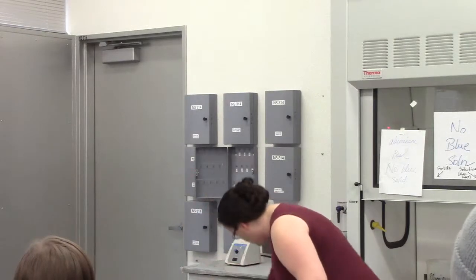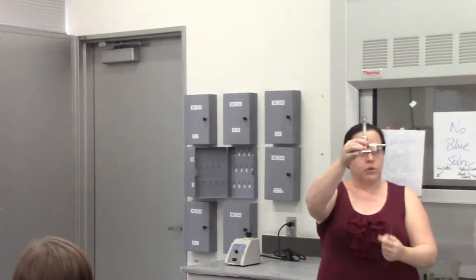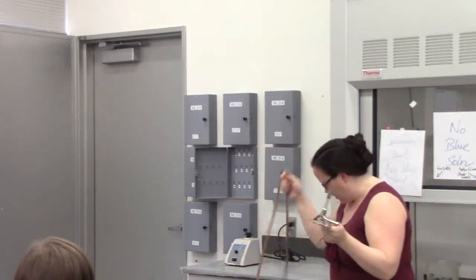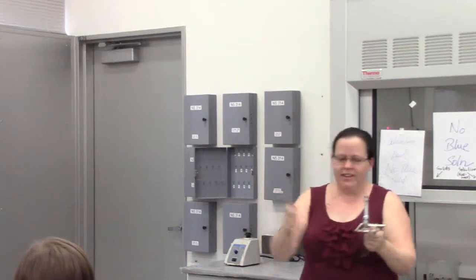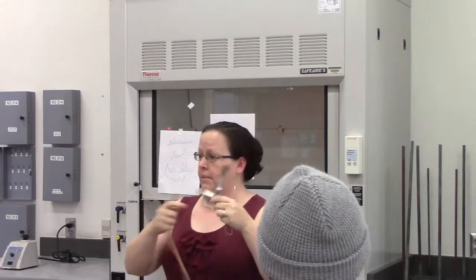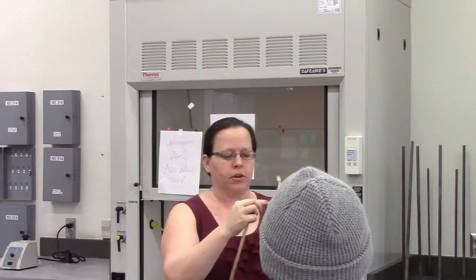So Bunsen burners, 2 drawers over here, one labeled Bunsen burners. That's where the burners are. One labeled burner tubing. That's where the tubing is. That is a really long piece of tubing. All right, that's that. Okay. So when you get to this point, I will help you set up your Bunsen burners and light them and adjust them correctly. But the first thing you want to do is get the tubing onto the end of the burner.